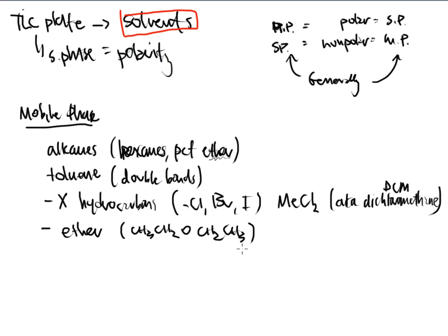That is organic. There's some carbons, there's some hydrogens, but we've got these pairs of electrons on the oxygen in the center, right here. And that creates some polarity that's associated with the solvent. Now, the number of carbons is not as great as petroleum ether would be, which is why this is more polar.